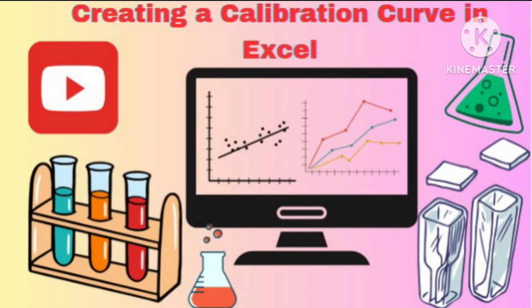In today's video, we will learn how to create a Beer's law calibration curve using Microsoft Excel. This is a crucial concept for pharmacy students as it's commonly used in spectrophotometry to determine the concentration of a solution. Let's dive right in.